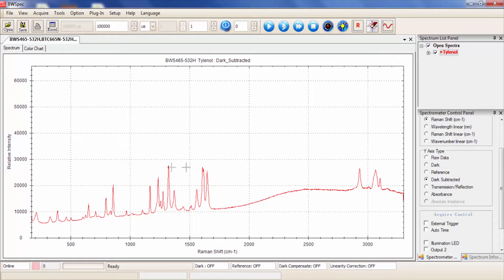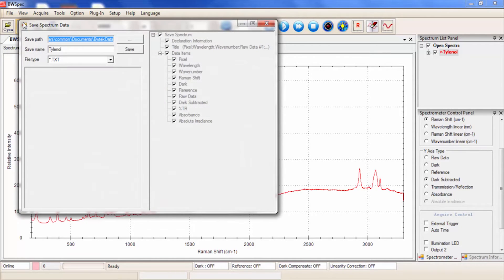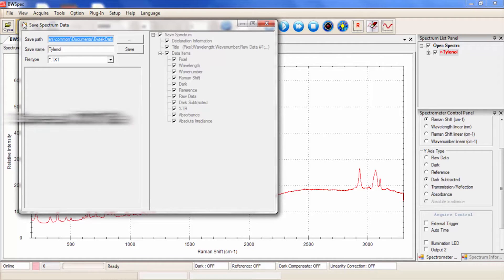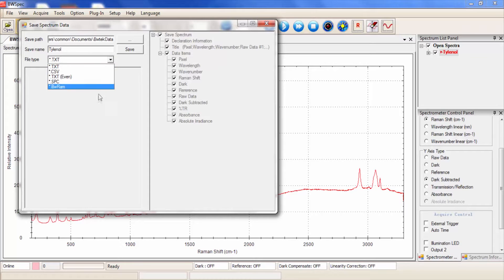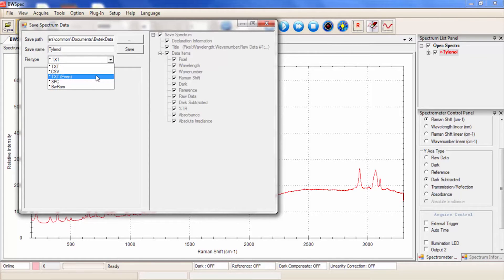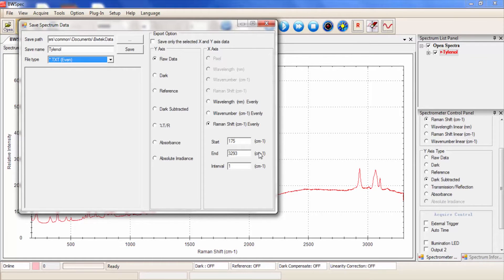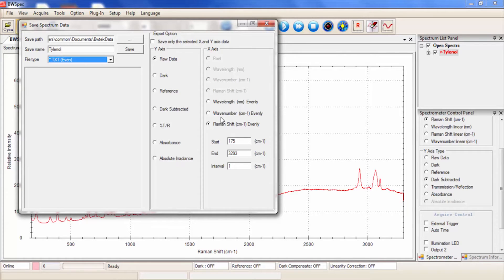To save your newly acquired data, click the Save icon. Here you can select the location, file name, and file format. We recommend saving as a .txt file, as this data can be reopened in BWSpec and manipulated if necessary. .txt saves the data at specific x-axis intervals which can be interpolated between pixels. .spc and .csv are formats for exporting data into other spectral programs.